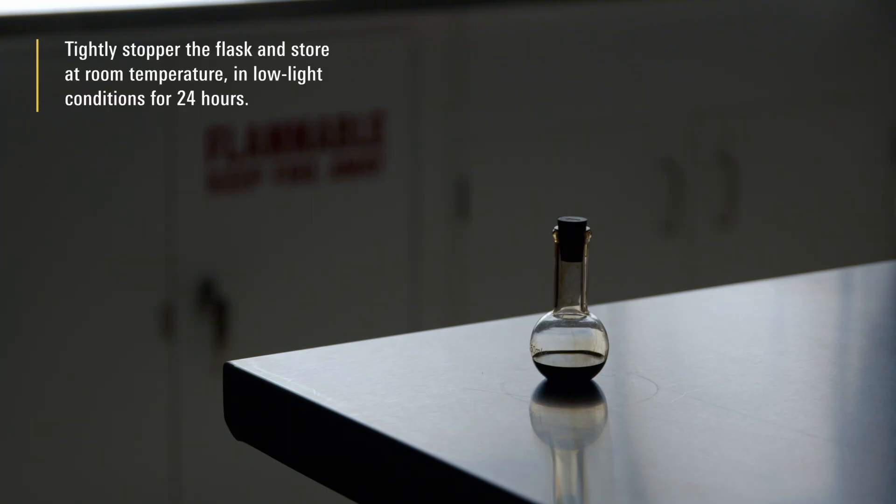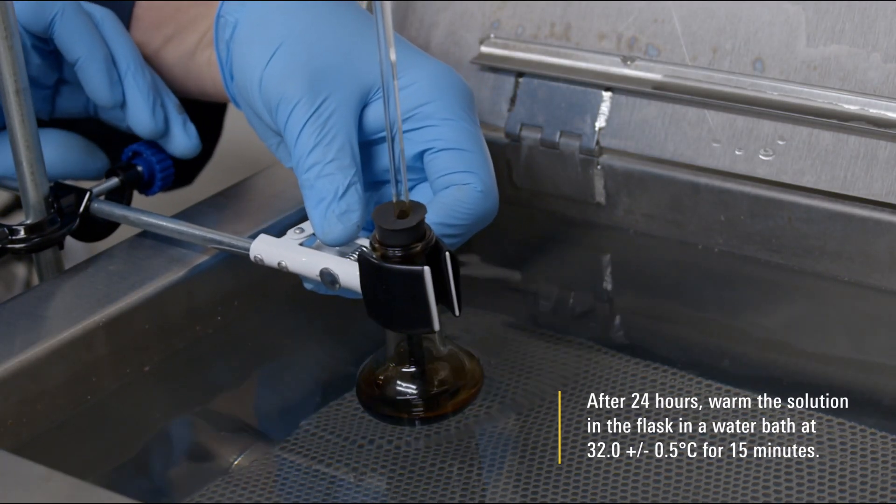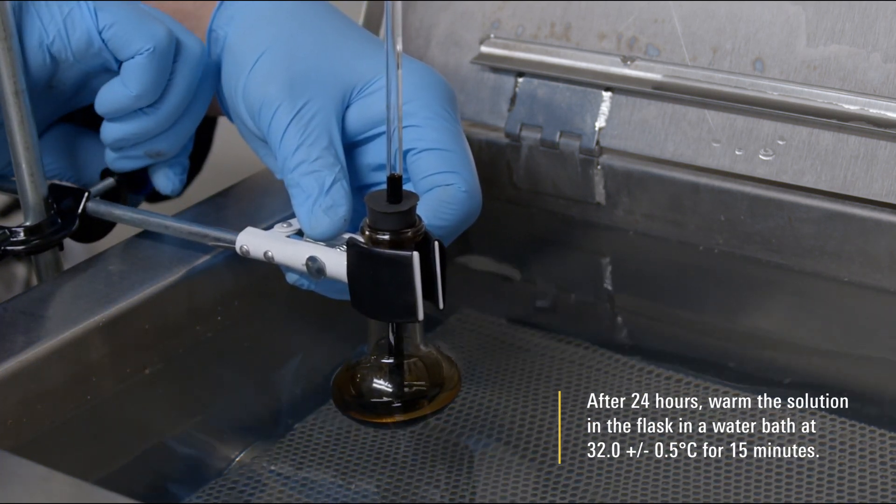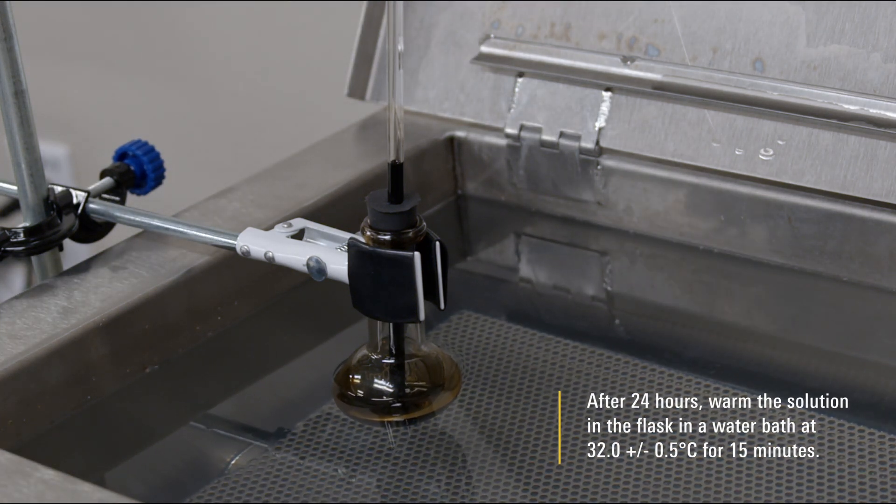Tightly stopper the flask and store at room temperature in low light conditions for 24 hours. After 24 hours, warm the solution in the flask in a water bath at 32.0 plus or minus 0.5 Celsius for 15 minutes.